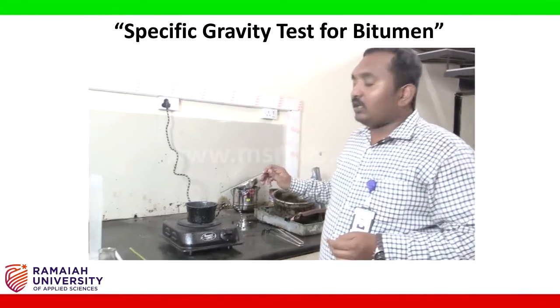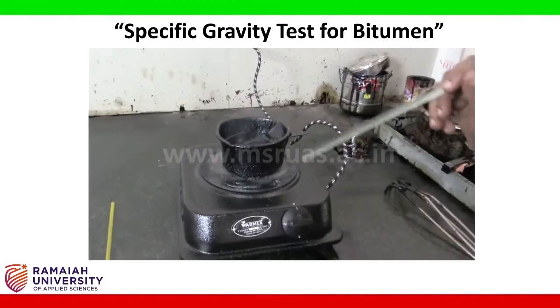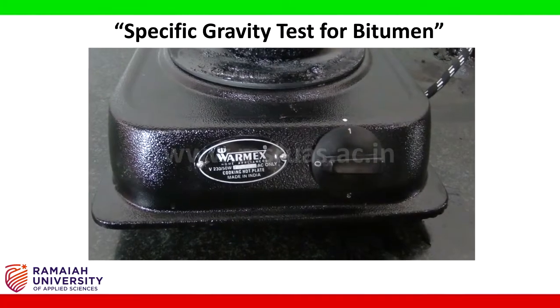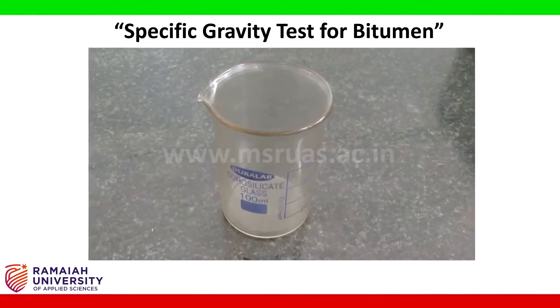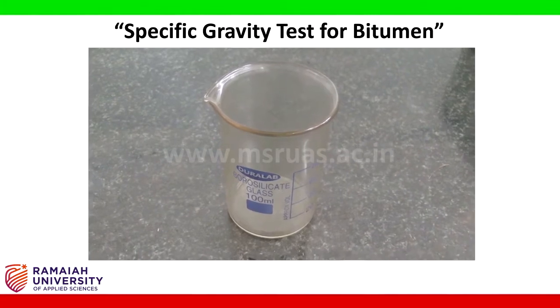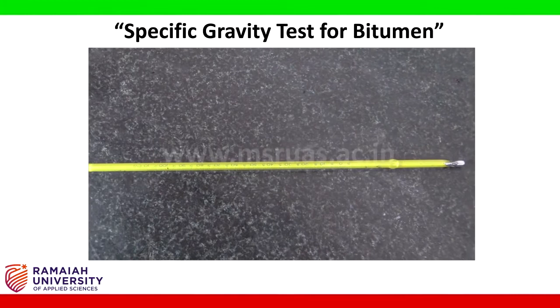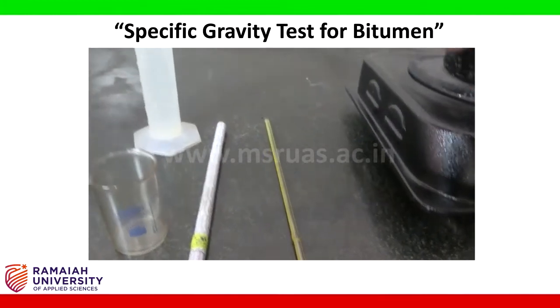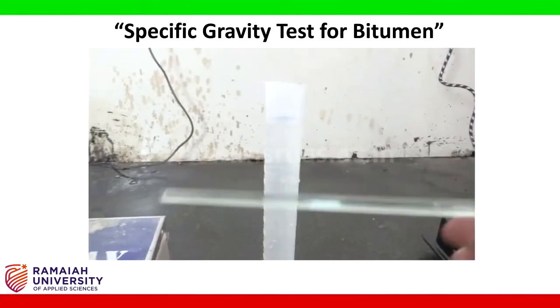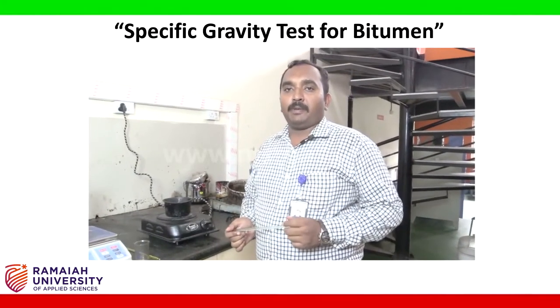We require a bitumen, a hot plate, a beaker for conducting the experiment, a thermometer for measuring the temperature, distilled water, and a weigh balance. Let us start the experiment.